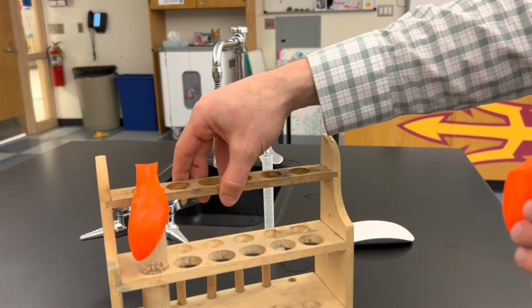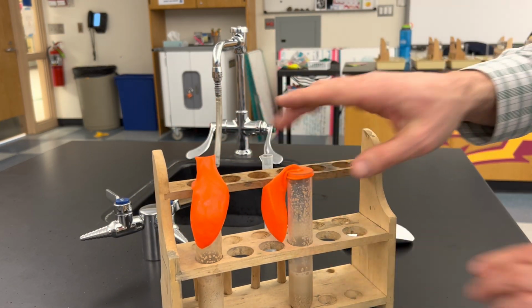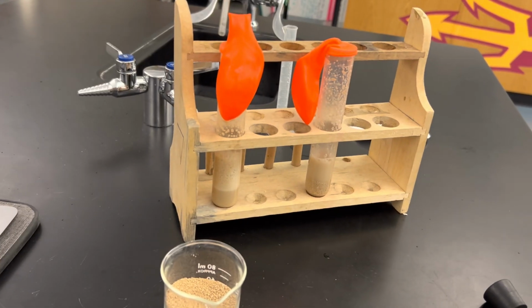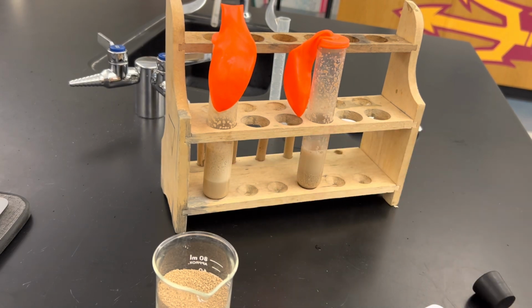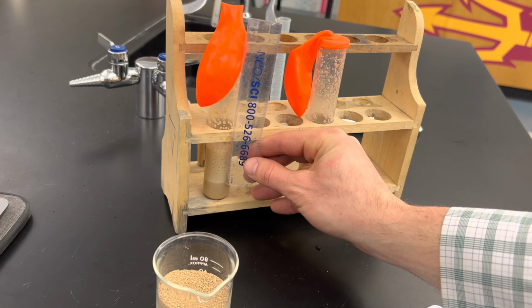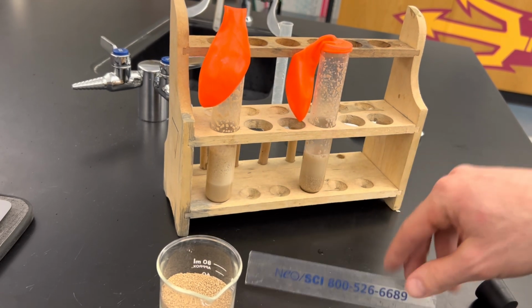So we can measure as a response the amount of CO2 given off. How can we measure CO2? Well, a simple lab we can do. This one's done. This one I already prepped from before. Notice that there's some foam here. This is all foam. If we take a ruler, we can measure how high it was up. It's hard to see. When you're doing it yourselves, you can actually measure the CO2.